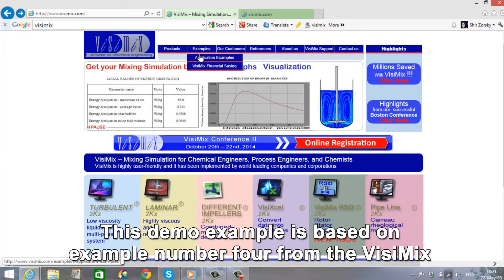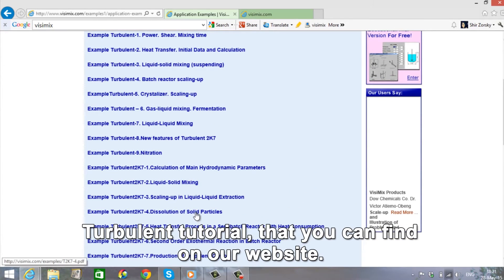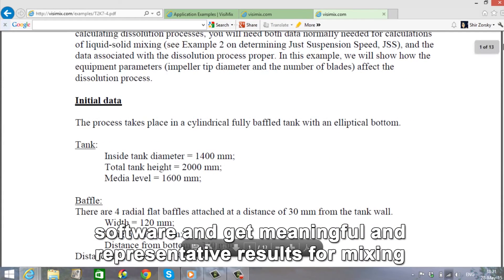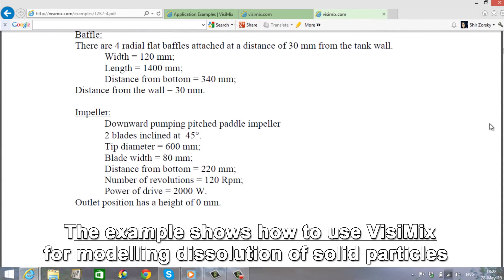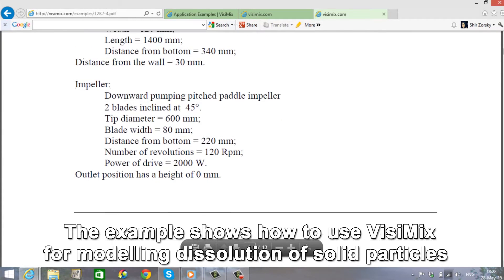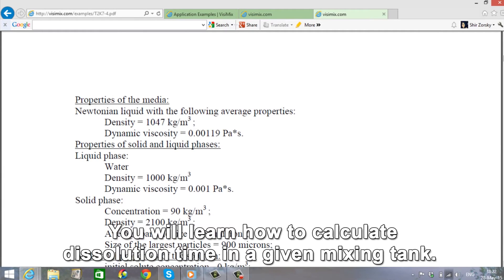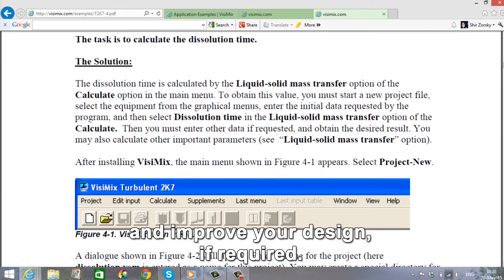This demo example is based on example number 4 from the Vizimix turbulent tutorial that you can find on our website. We want to show you through this example how you can operate Vizimix software and get meaningful and representative results for mixing in your stir tank. The example shows you how to use Vizimix for modeling dissolution of solid particles suspended in liquid. You will learn how to calculate dissolution time in a given mixing tank. You will evaluate the suitability of this tank for your process and improve your design if required.